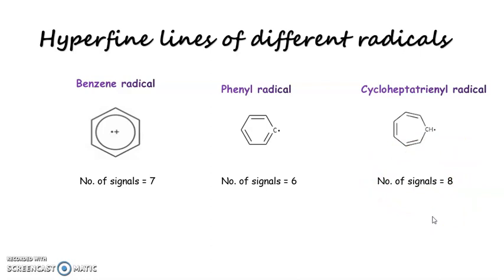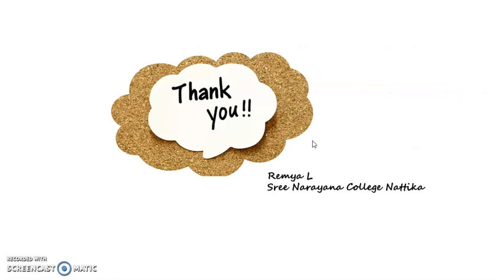Thus, ESR can be considered as a fingerprint that helps to identify the free radicals present in a sample. Here, I am concluding this lecture on the basics of ESR spectroscopy, and it is sufficient for you. Thank you, my dear students.